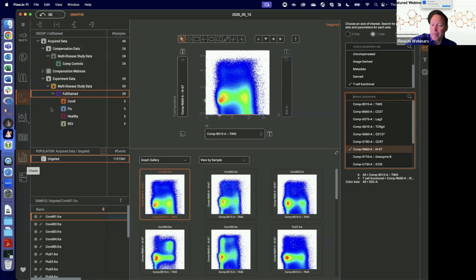That's the great work by Mario at the NIH, and you'll see that there's some similarities because I love them so much. Okay, so the files from version 10 will not immediately be compatible in version 11. I see that question coming in repeatedly. Not yet. We will do that. Clearly, my first feedback from doing this webinar is that that is a feature that people would like, to be able to import older workspaces into 11. There is some difficulty in doing that, in that the structure of the hierarchy, well, is now hierarchical.